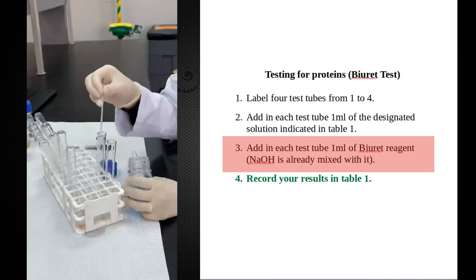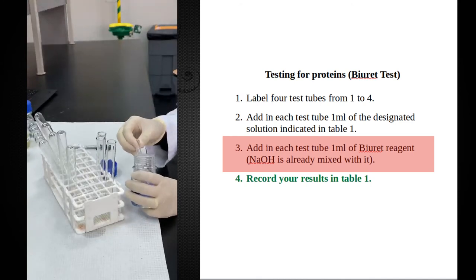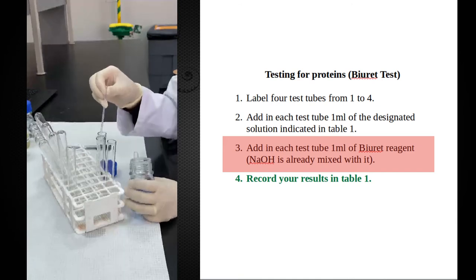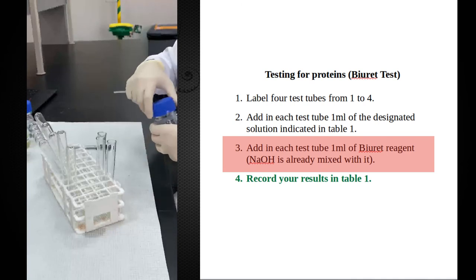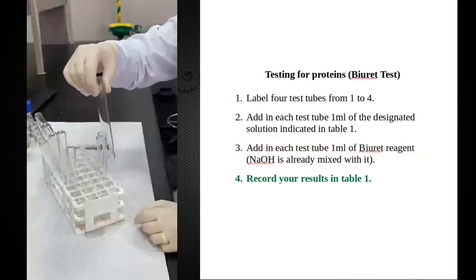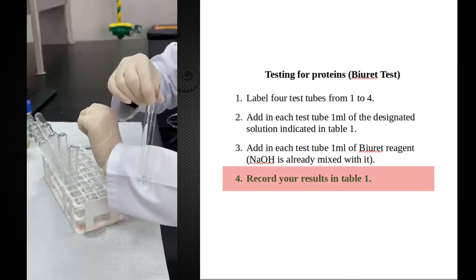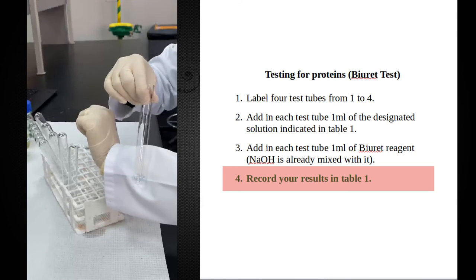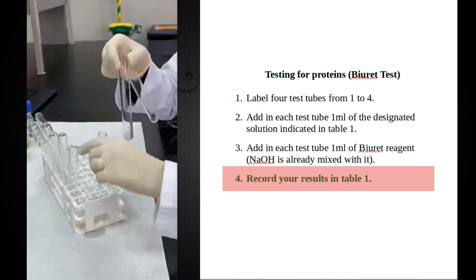A blue color is an indicator of a negative result. There are no peptide bonds. A violet color is an indicator of peptide bonds. We are going to mix our test tubes. So if you look at the negative control test tube, it's a very light blue color. This is how a negative result looks like.